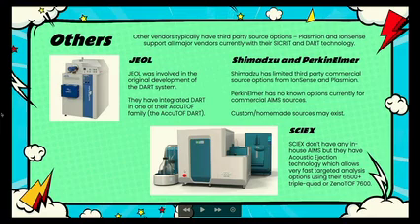And that fits on to things like the 6500 triple quad or the ZenoTOF 7600. And that's probably been updated in the last 2 weeks as well after ASMS, and I'm slightly behind with that. I did check all the websites, but ASMS updates have not quite fed through to everything yet. Because I know there's a new or an updated 7500 plus triple quad out from SCIEX as well, which probably is Echo compatible, but don't quote me on that.